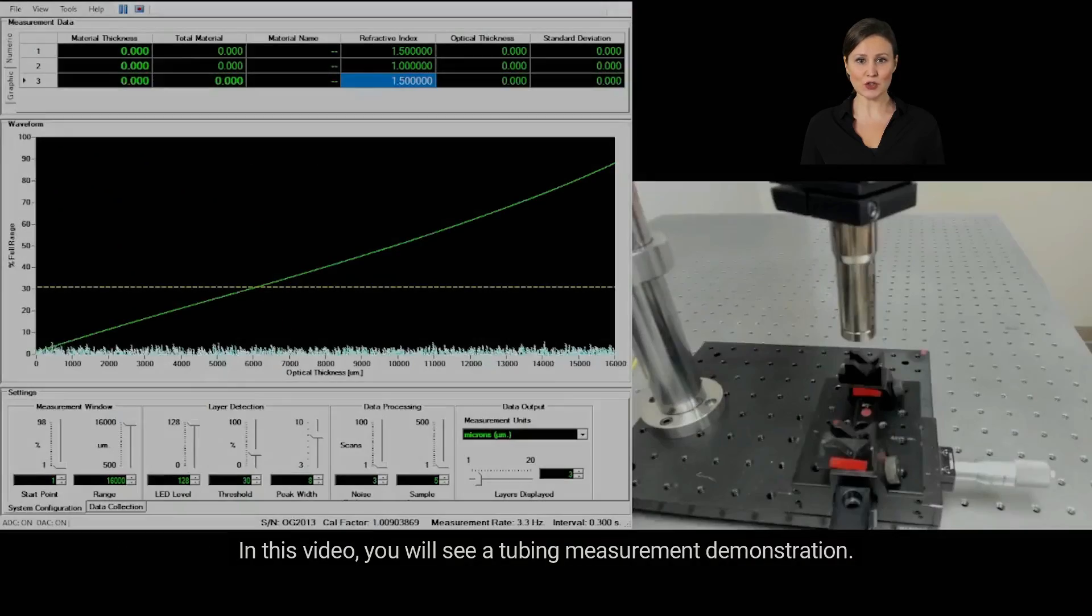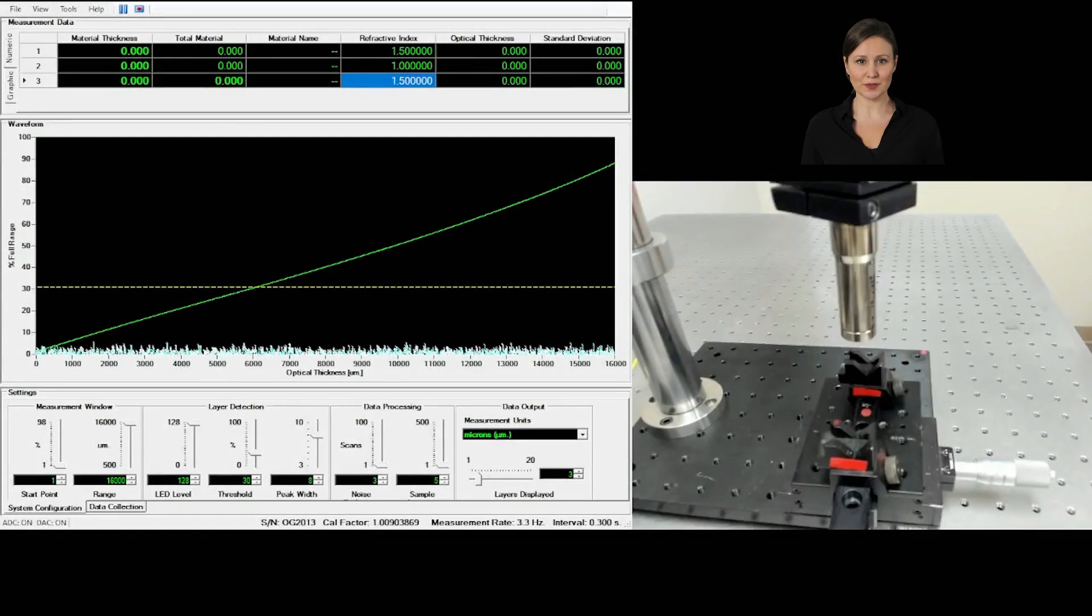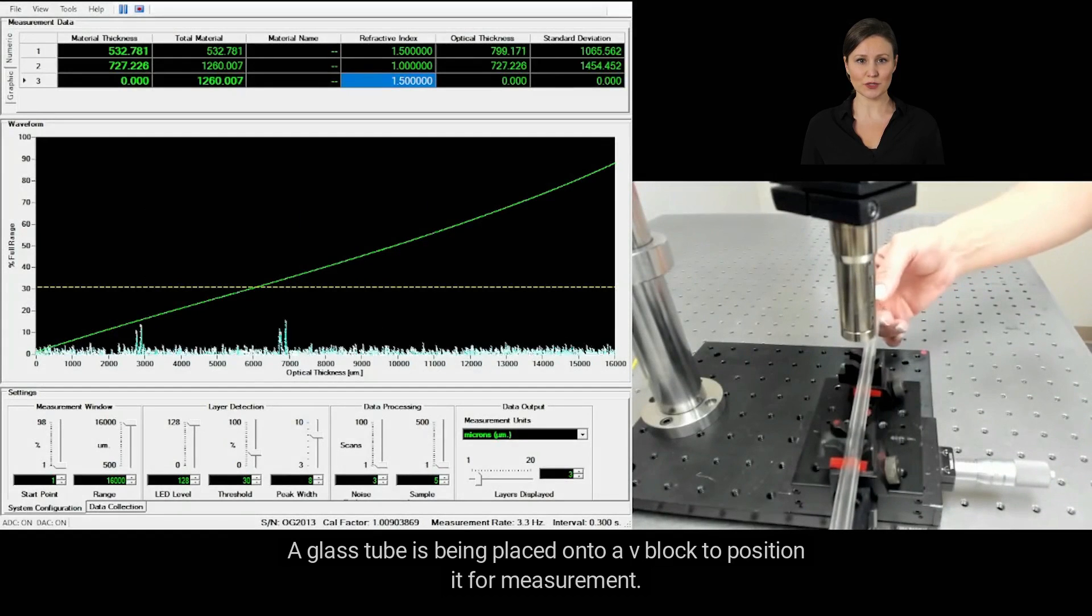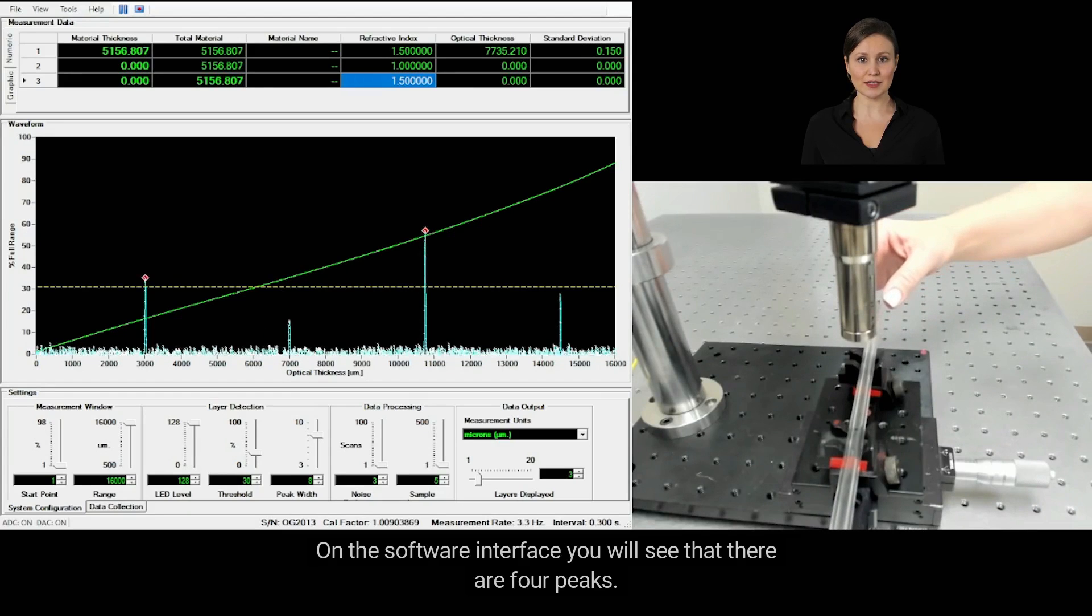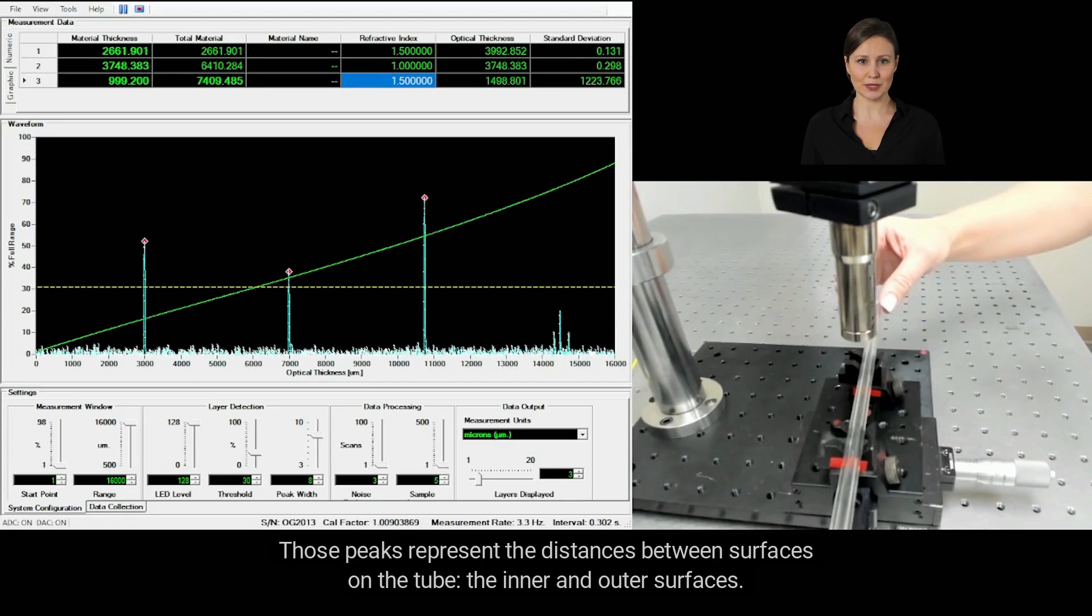In this video, you will see a tubing measurement demonstration. A glass tube is being placed onto a V-block to position it for measurement. On the software interface you will see that there are four peaks. Those peaks represent the distances between surfaces on the tube.